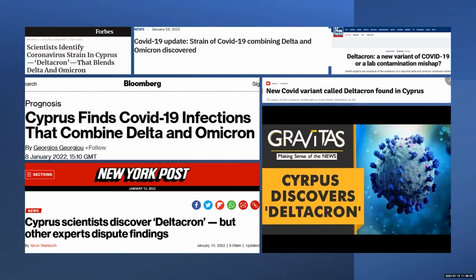And it's quite topical, in that it's incredibly important to have some form of improving or making the protocols themselves a lot easier. Josh already mentioned how it would be nice to make this protocol, especially for Oxford Nanopore, have a reduced number of steps, or to make it more accessible and more user-friendly. One of the main reasons for that is obviously, as this is a protocol involving amplicon sequencing, there is a high chance of contamination.